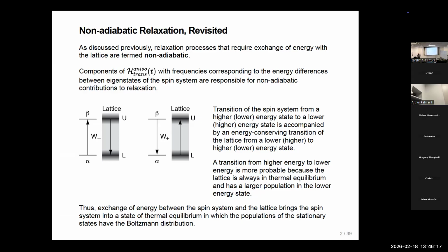In principle, I should be able to put a thermocouple into the NMR tube, do a 180-degree pulse, say, on the water, and then watch the temperature of the water change as the water spins relax back to Boltzmann equilibrium. And in fact, people have done that. It's ridiculously difficult because the amount of energy in the spin system is, I think you calculated this in problem set 1, a tiny fraction of kT.